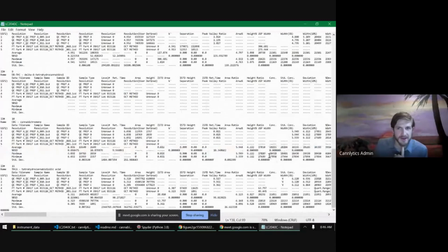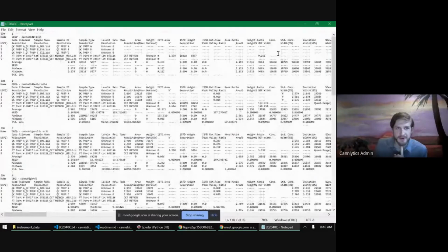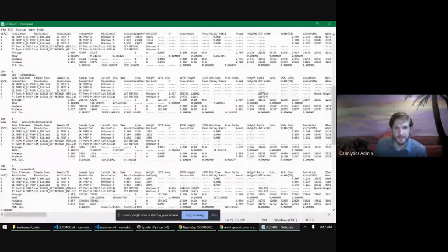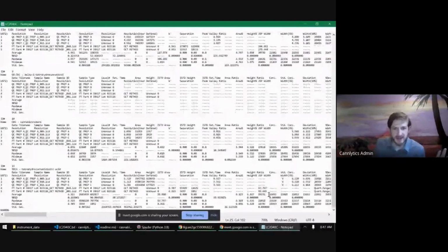So as you can see, it's easily quite a nightmare because you're having to do all of this crazy parsing and the number is just hidden right there. And then for one sample, you're having to do 11, in this case, 11 compounds.